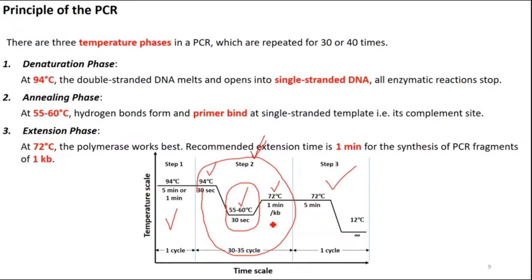And some of the fragments that miss the opportunity of full extension are given an extra extension time of 5 minutes, and at the end the final PCR reaction is stored at 12 degrees centigrade in the machine. Okay, so some of the resemblance I always give, but I will take a very short time today about the introduction.